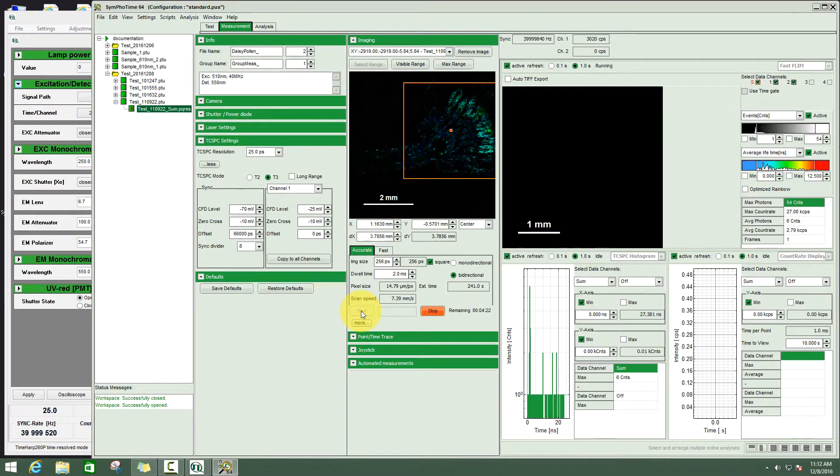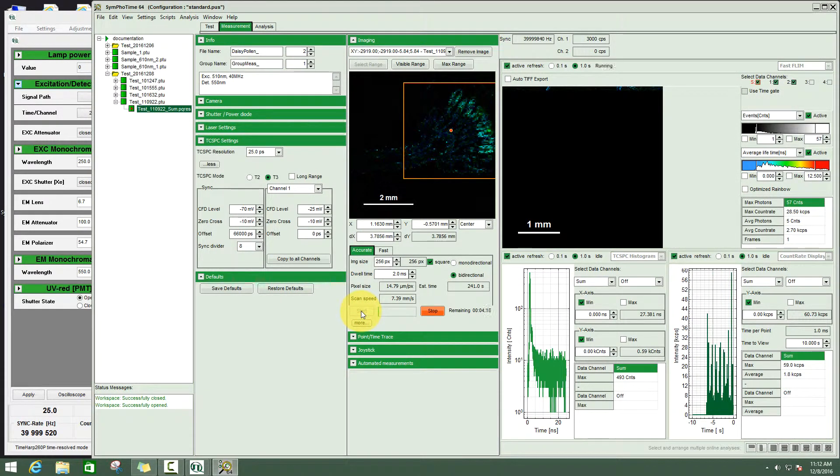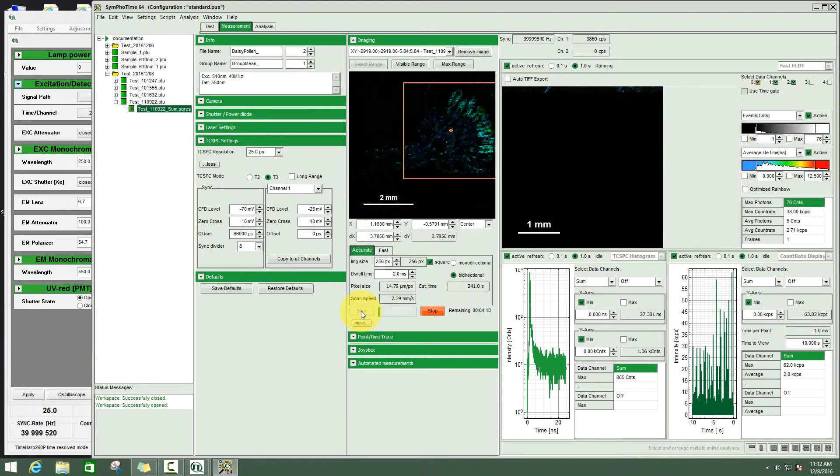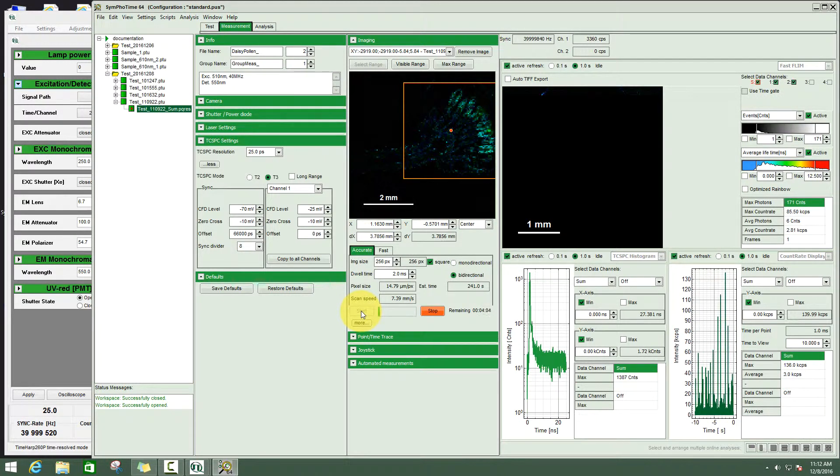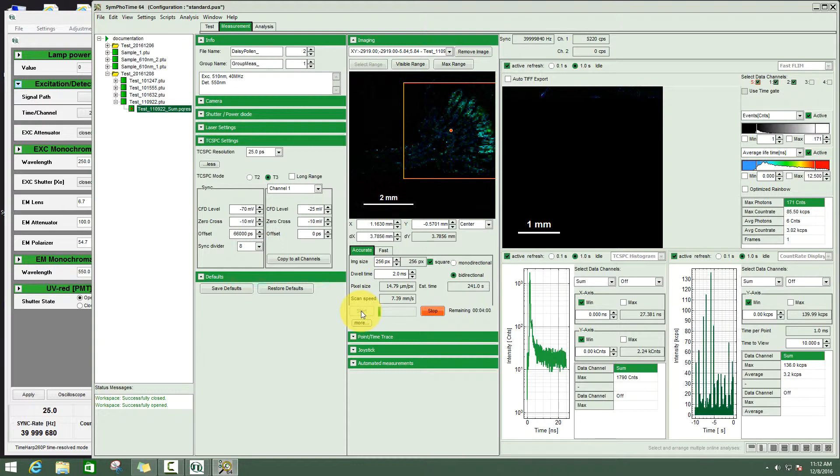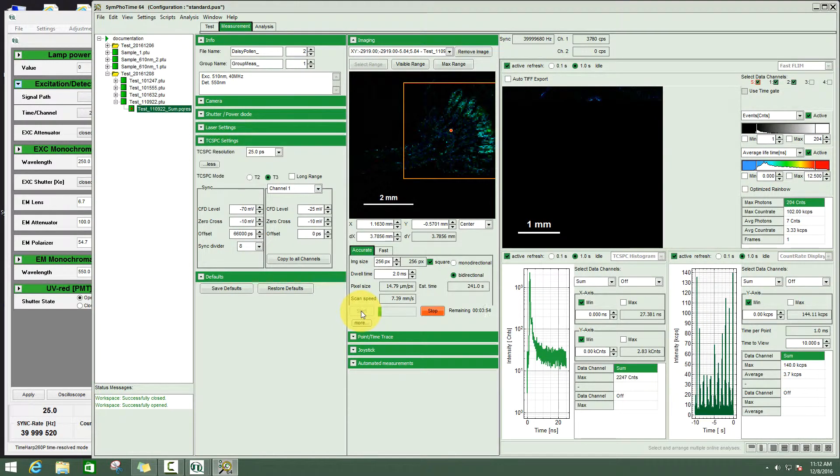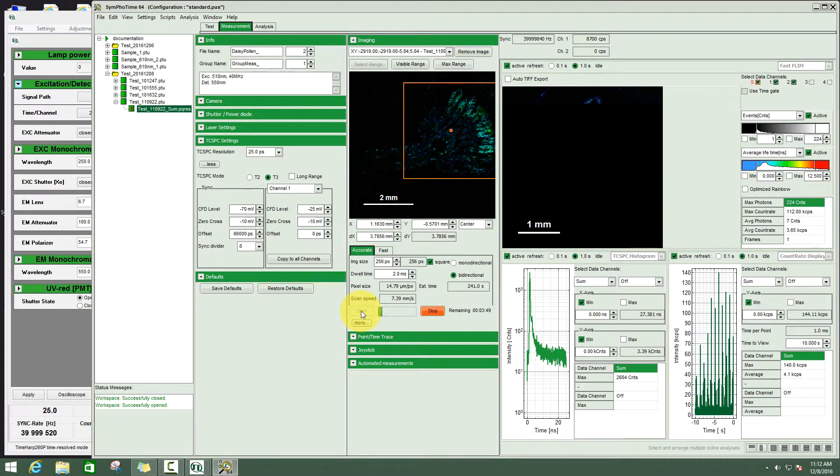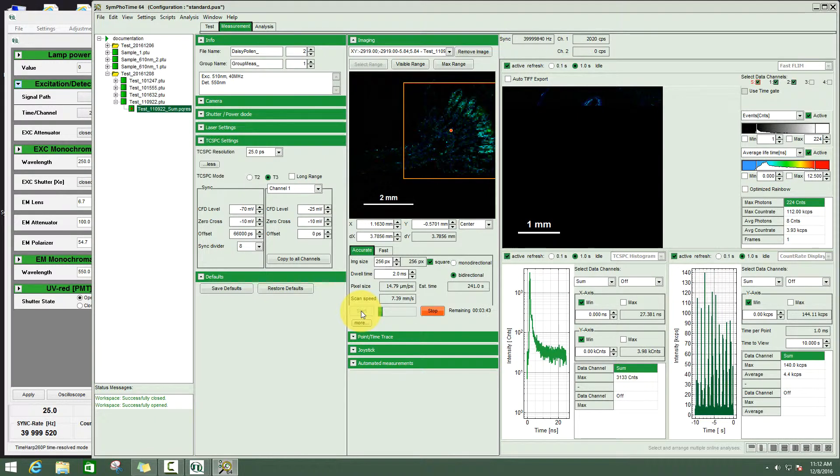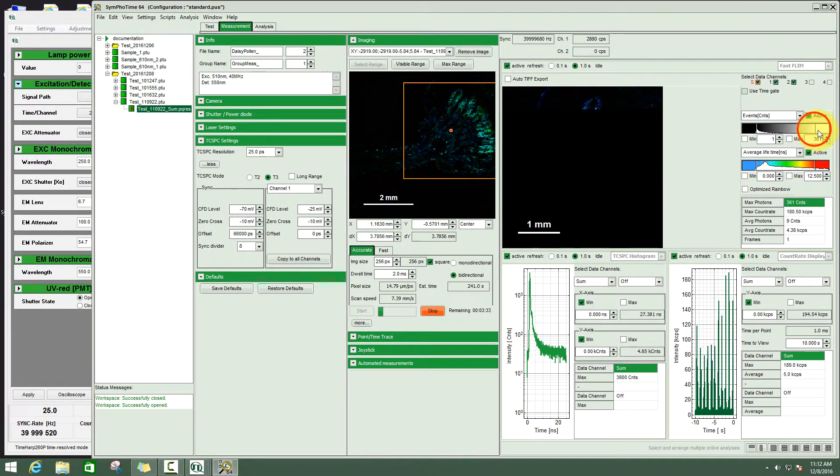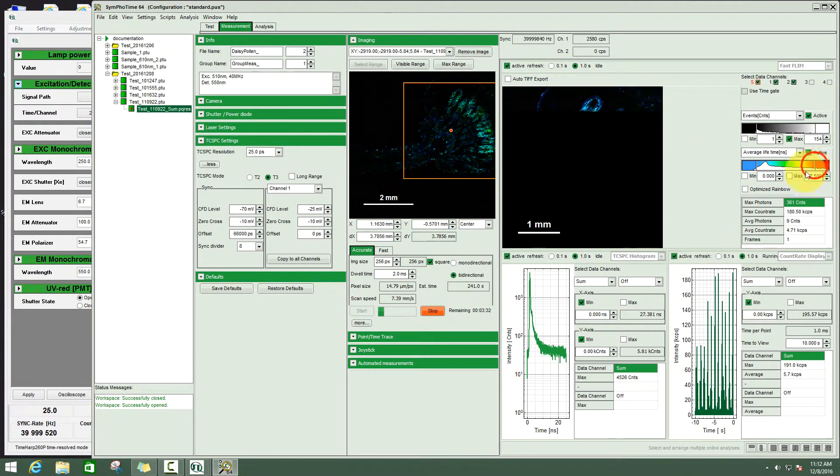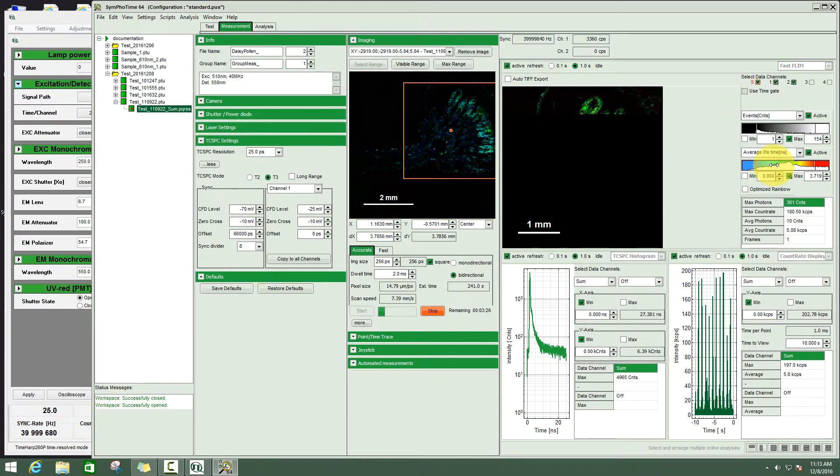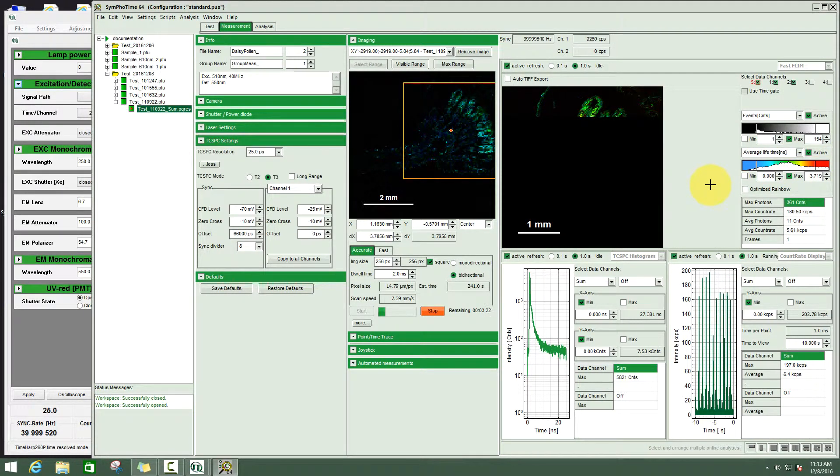In the measurement mode you see we have on top the image. On the lower left we can see the decay. On the lower right the intensity over time. You can adjust the intensity scale and the lifetime scale to enhance any contrasts that are in the image.